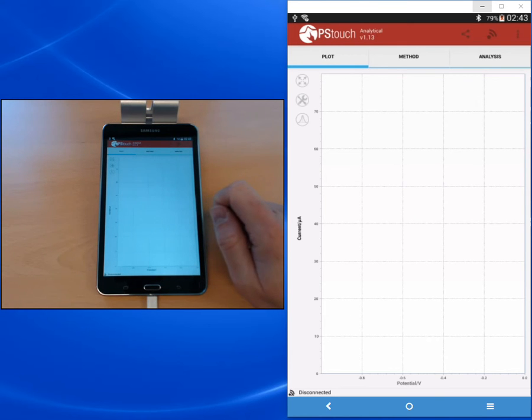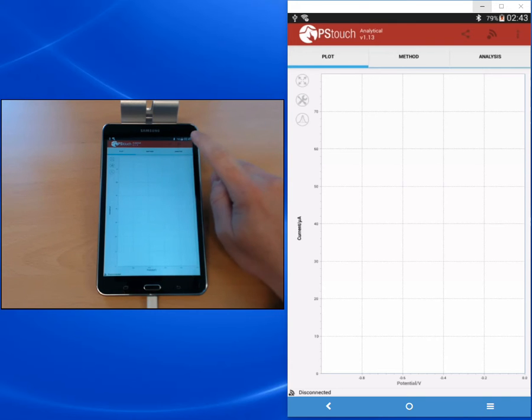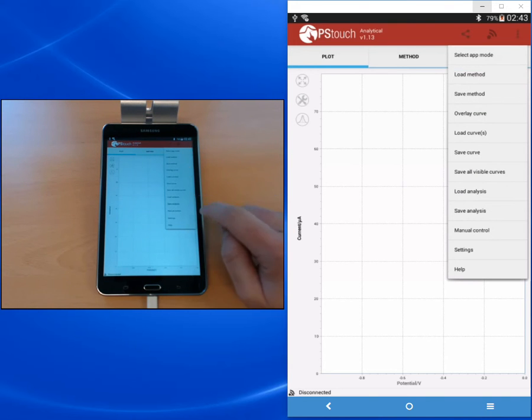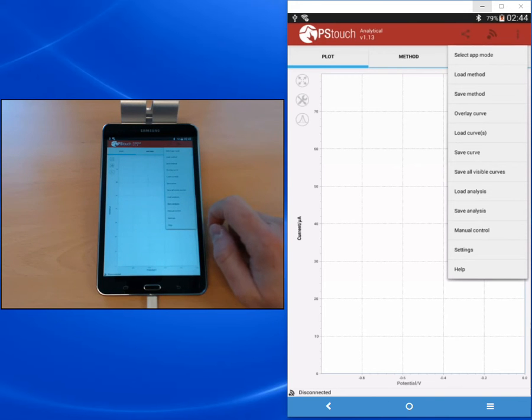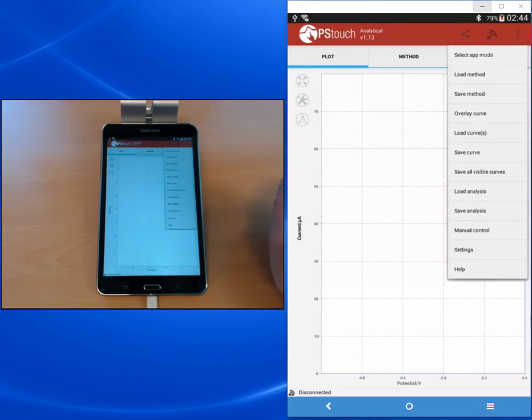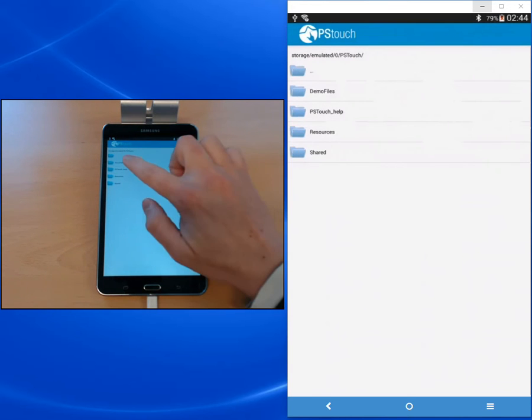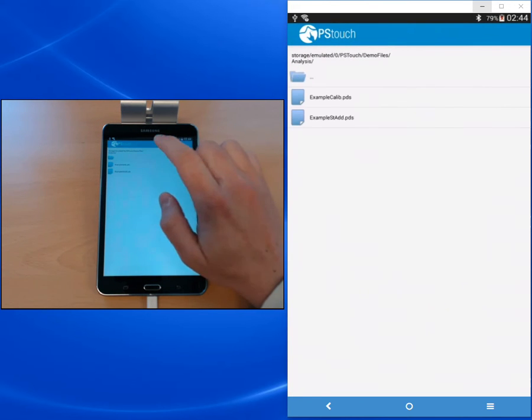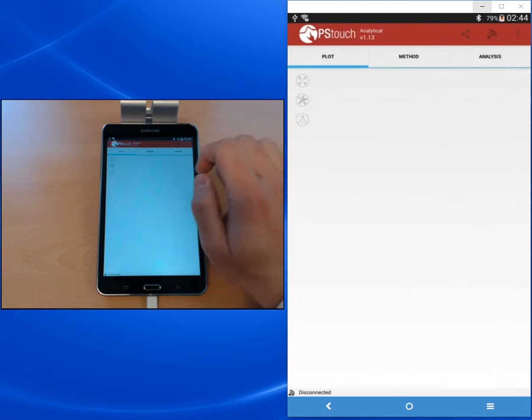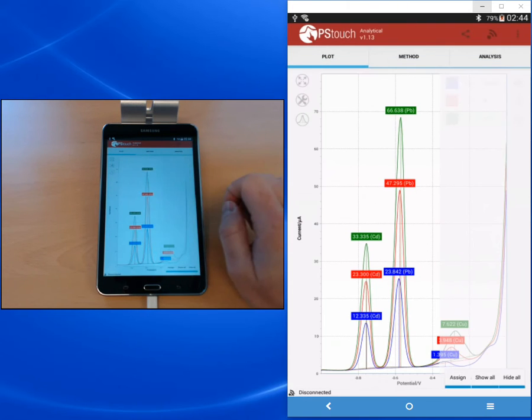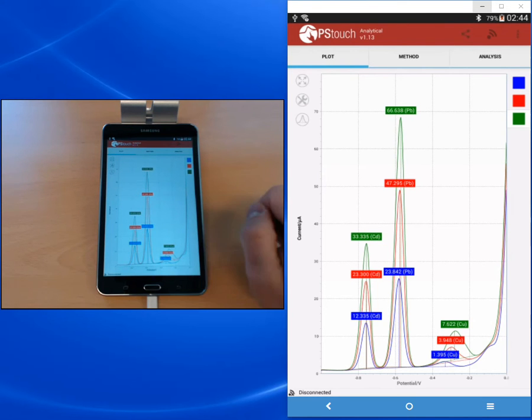Doing the actual measurements in this video would make the video quite long, so I will load an already set of analysis curves. When you go to the menu, you see we have two new menu options which are load analysis and save analysis. In the analytical mode you can save a complete set of curves for one analysis together with the parameters and analysis information you put in. I'm loading an example for the standard addition and you see we have here now three curves with three different peaks.